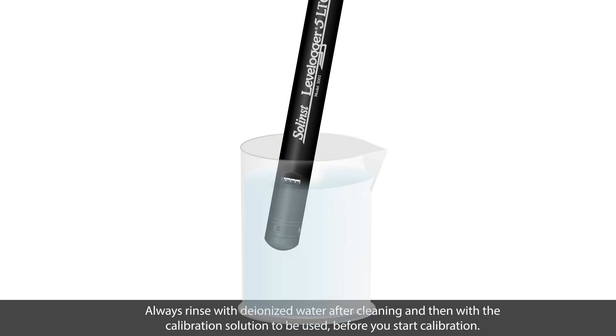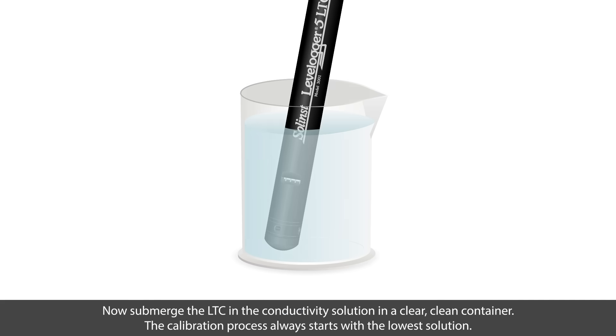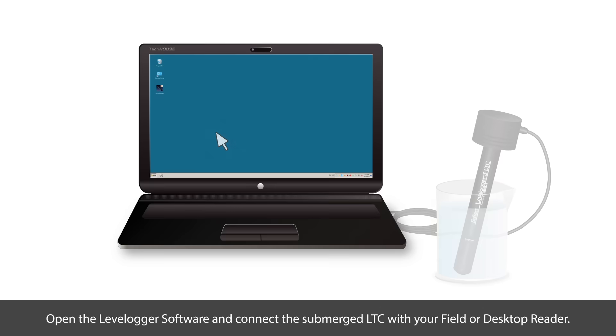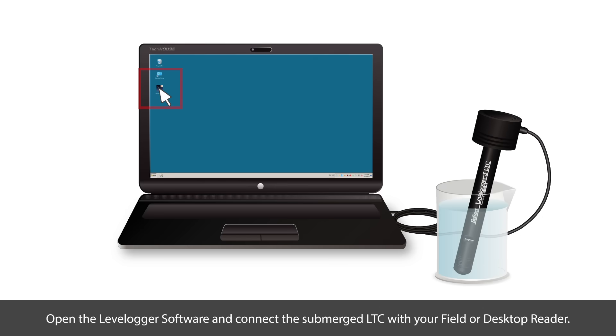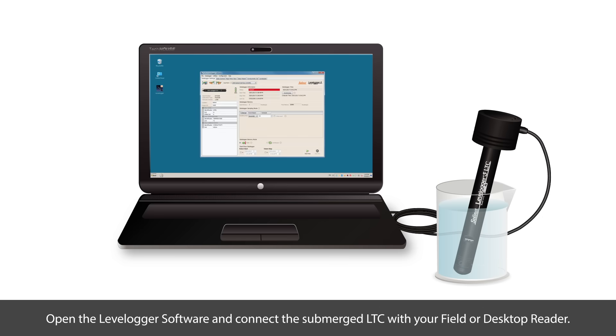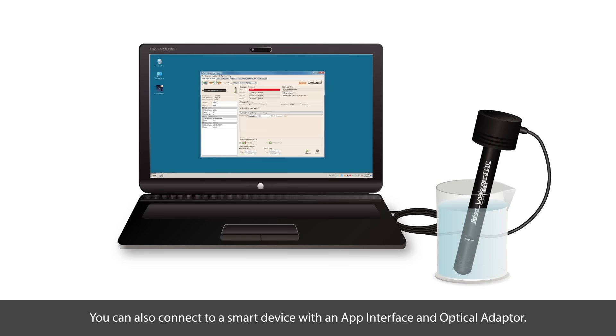Now submerge the LTC in the conductivity solution in a clear clean container. The calibration process always starts with the lowest conductivity solution. Open the LevelLogger software and connect the submerged LTC with your field or desktop reader or with your smart device via an app interface and optical adapter.